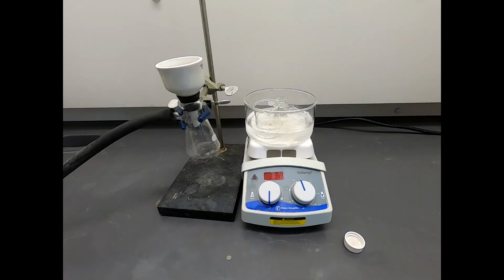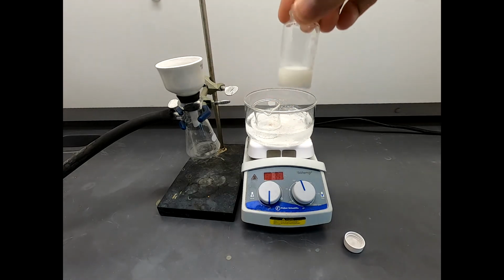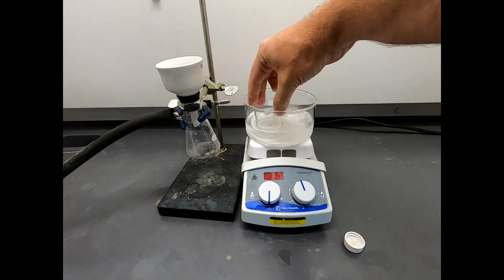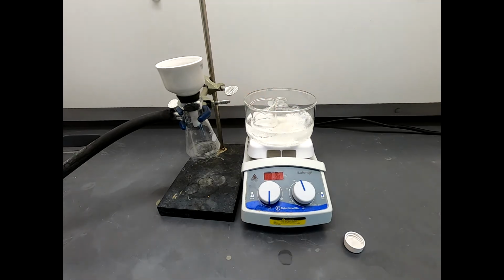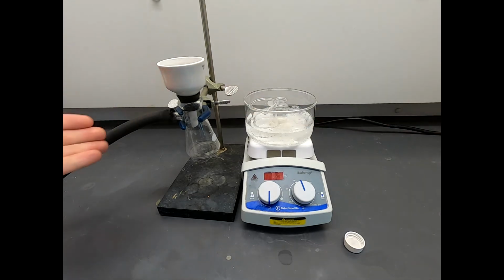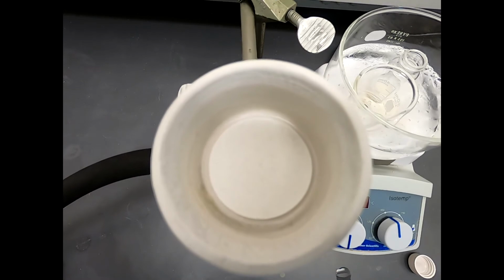Well, we are ready to do a filtration. So we have our product. It's nice and cold, and it's nice and thick with precipitate, so that's good. We have our cold rinse solvent. That's about 1-to-1 ethanol water. And now we have our filtration set up, our Buchner funnel and a sidearm flask. And we can take a peek in here and make sure the filter paper is covering up all those holes, and it is.